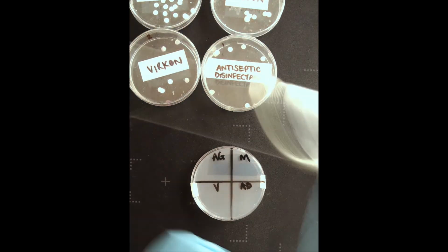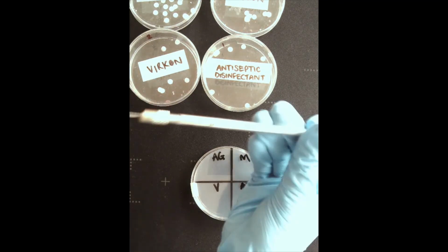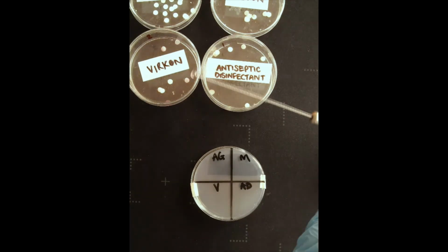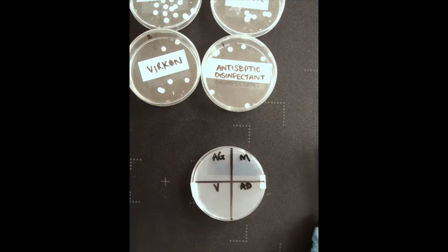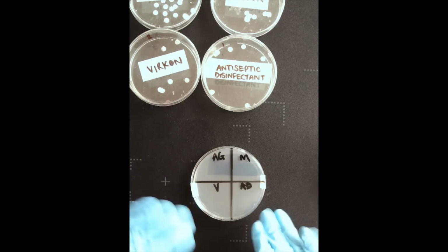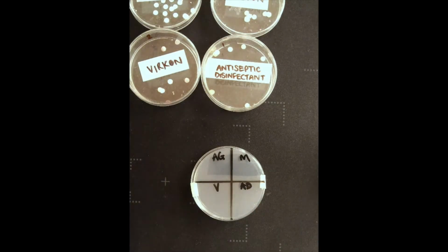To transfer the bacteria, I'm going to use an inoculating loop. It's just a long stick with a tiny loop at the end. Now, it's very important that I use aseptic technique. That means I'm going to try and prevent contamination by unwanted microorganisms that can potentially affect my results and result in the growth of pathogens that are harmful. So the Petri dish and the culture medium, the agar jelly, have been sterilized before use. That means they've been heated to a very high temperature to kill any unwanted microorganisms.